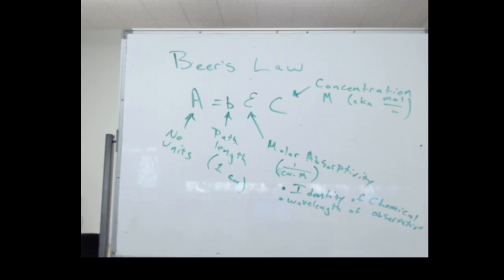So this is the base idea of Beer's law. Hopefully that helps make sense of the background reading for the absorption lab and some of the calculations you need to do. In another video, I will do 1 or 2 Beer's law calculations for you to look at as well.